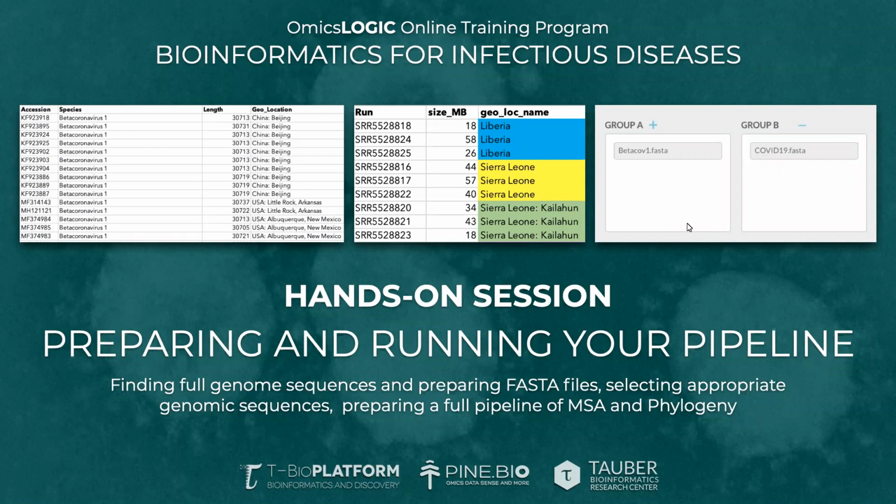Today, we'll do a hands-on session to prepare and run your pipeline. We went over the same pipeline last time conceptually, and today we are going to try and do it together. So welcome back, everyone. Today our purpose is to find the full genome sequences, prepare FASTA files that are ready for analysis, selecting the appropriate genomic sequences, and running a full pipeline and starting to look at some of the outputs from that pipeline.